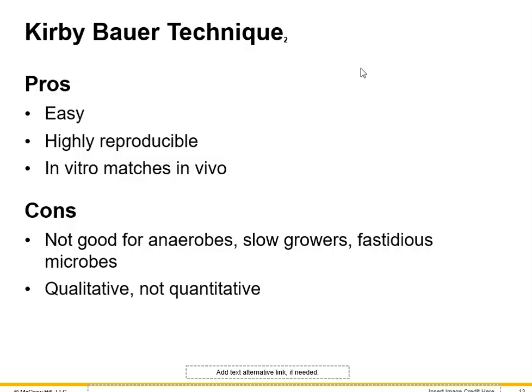It's also very qualitative versus quantitative. We're not necessarily getting numbers, a lot of data, even though we are using a table and measuring the distance, but it's up to everybody who is doing the measuring. Where I might say that zone ends here, somebody else might think the zone is extended a little bit further.